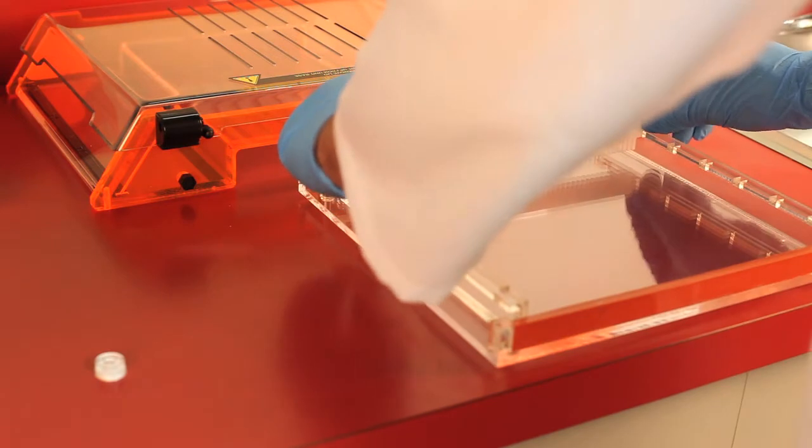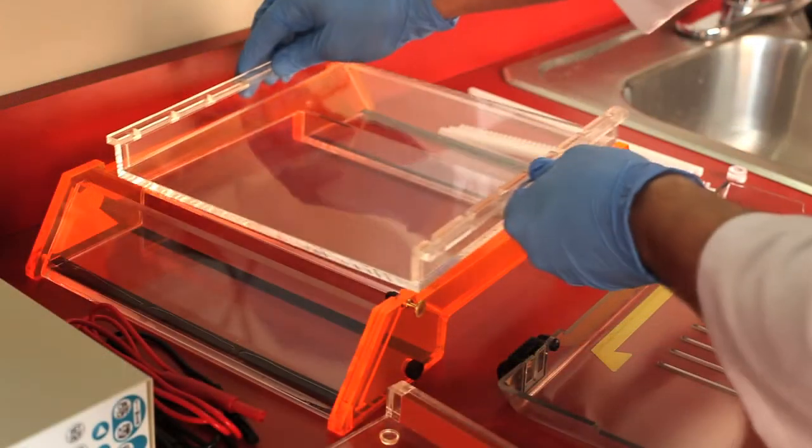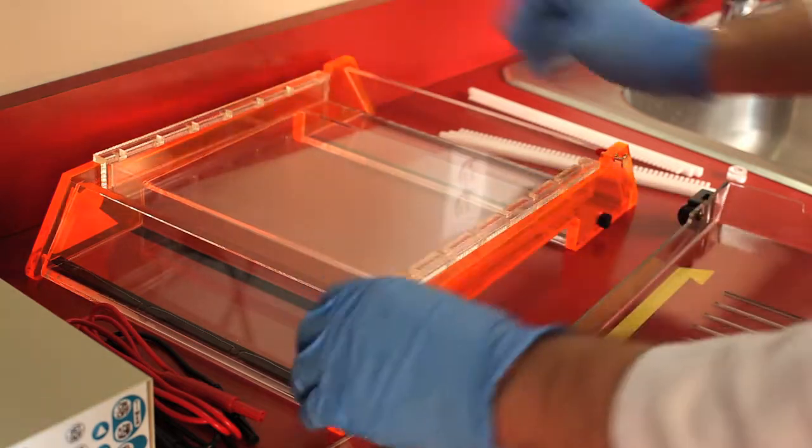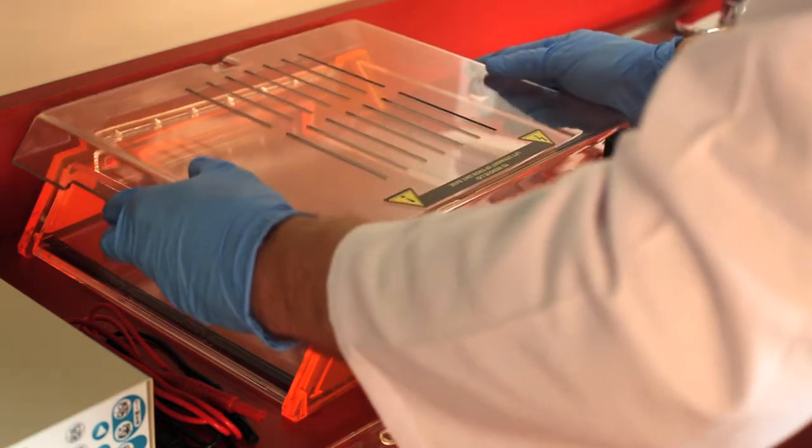Up to 300 samples can be completed in 15 minutes. Constructed of durable cast acrylic, this system can withstand high voltages and extreme temperatures without cracking or warping like injection molded systems.